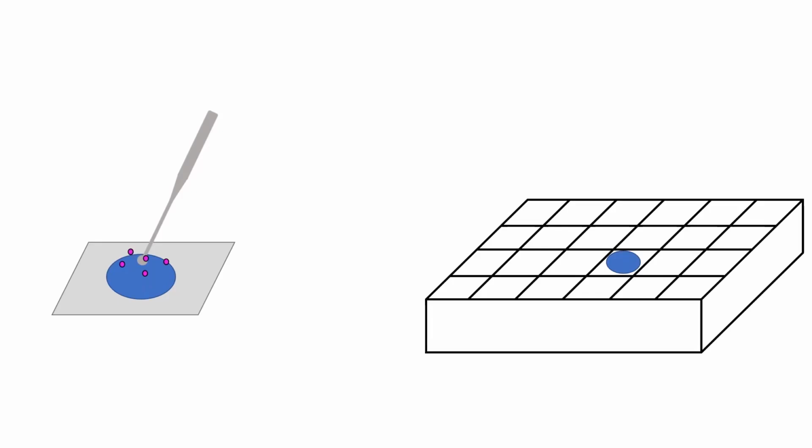Crystals or crystalline precipitate is crushed up into microseeds, which can be used to start crystal growth in completely independent conditions. At the same time, we introduce a phasing molecule called I3C into the crystallization condition. This molecule provides a large anomalous signal which allows the structure to be solved via single wavelength anomalous dispersion phasing.